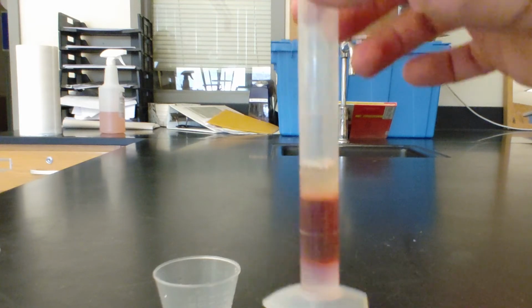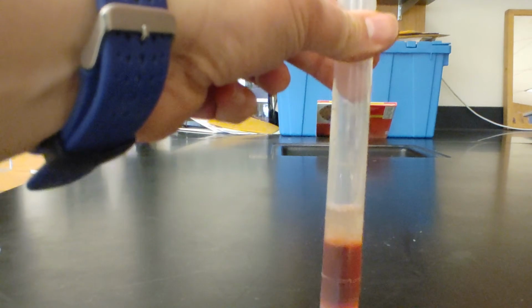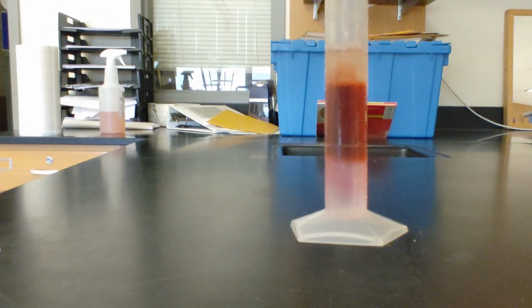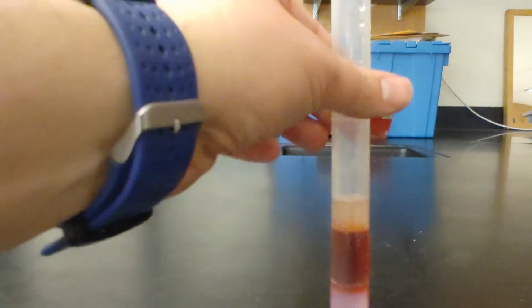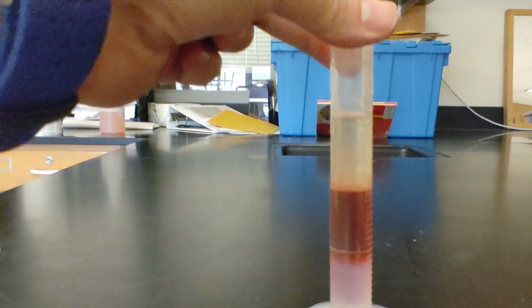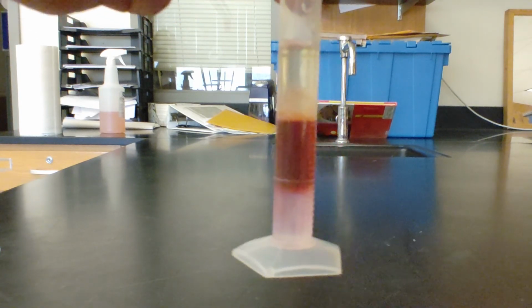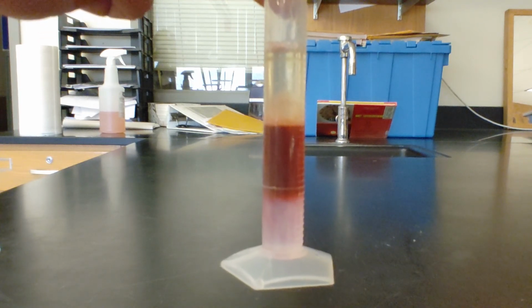And if I were to add more glycerin to this, I'm just going to pour it straight in. You'll notice that glycerin just goes straight down through everything because it is the most dense. And if I put the rest of the oil in, you'll notice that that stays on top because it is the least dense. All right, I hope this helped you out, and feel free to go back and watch the video again.